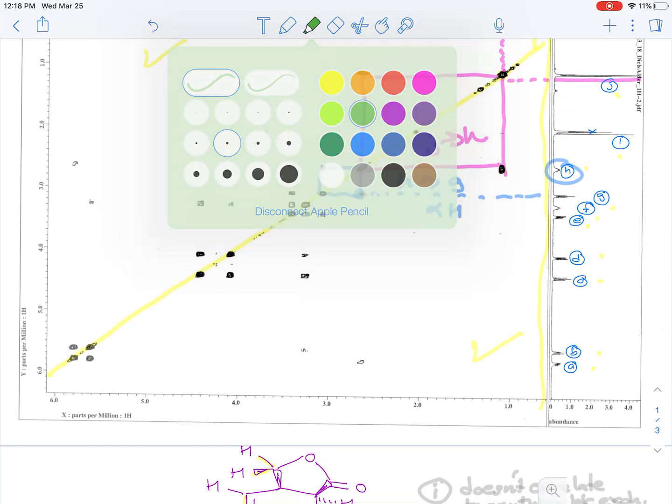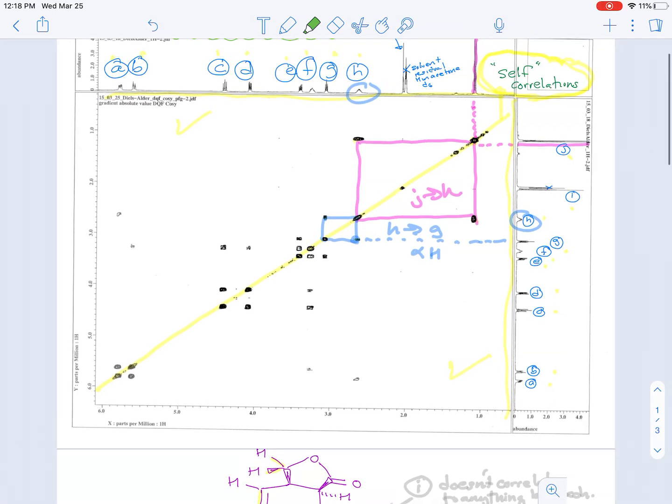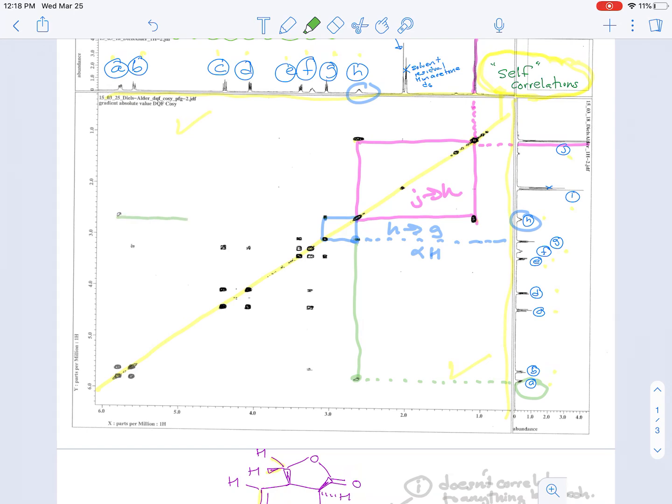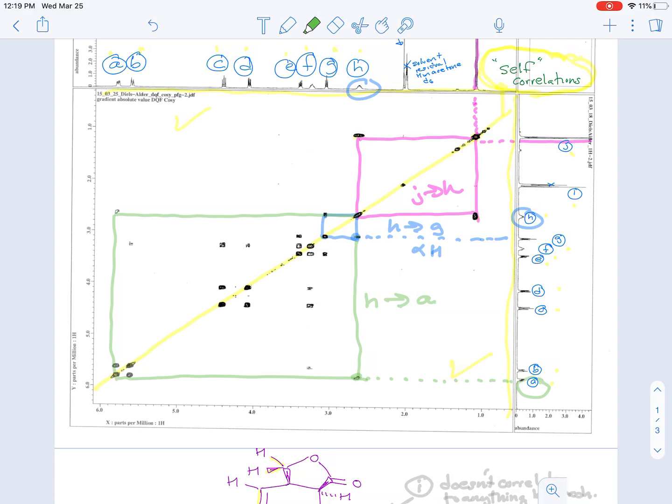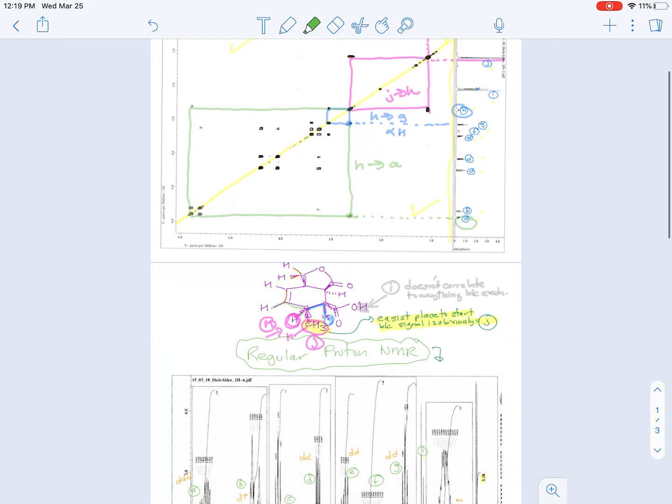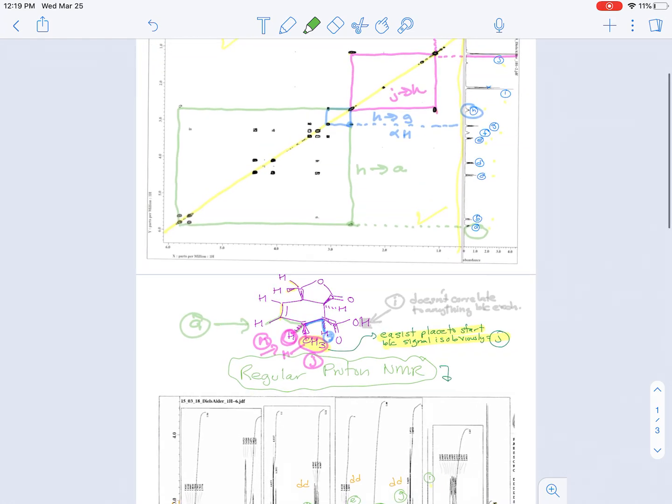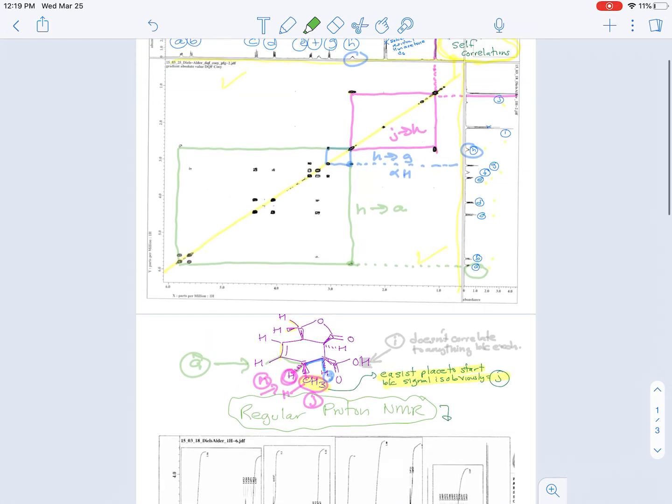Now we can look at the other signal, which would be to the vinyl hydrogens. And you can see that H also correlates to this signal down here, and that's going to correspond to vinyl hydrogen A. So there's kind of the correlation box for that. And again, that's going to be H to A. So this signal is A.